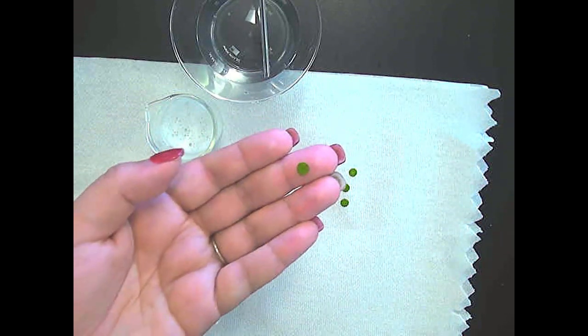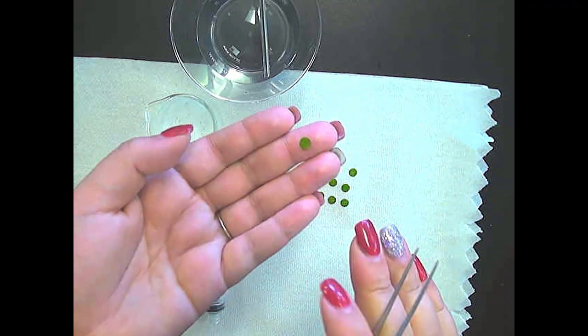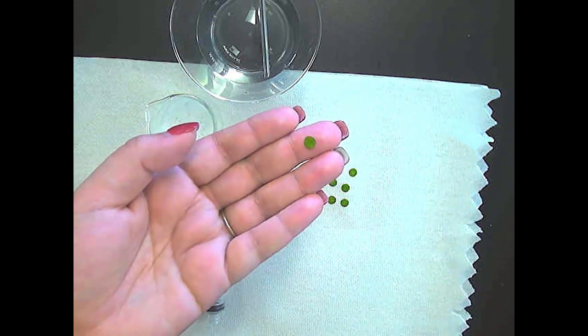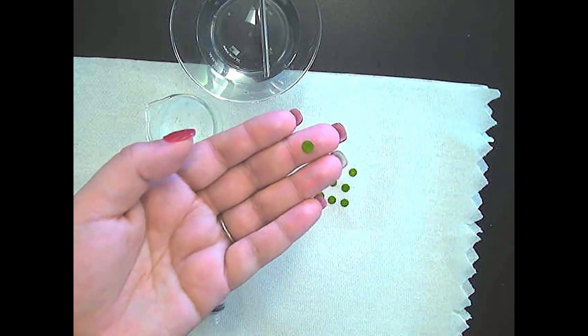So I'm going to show you how we're going to remove the air, and then we will switch camera angles to show you from the side the chads as they are floating, as they are performing photosynthesis, how many are floating at each of the time intervals.